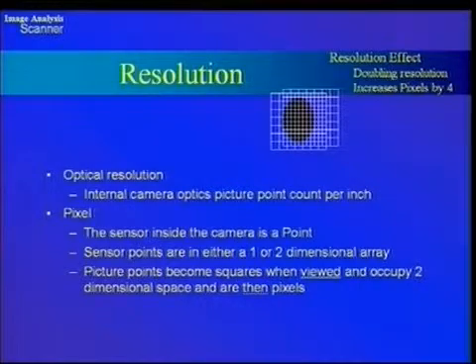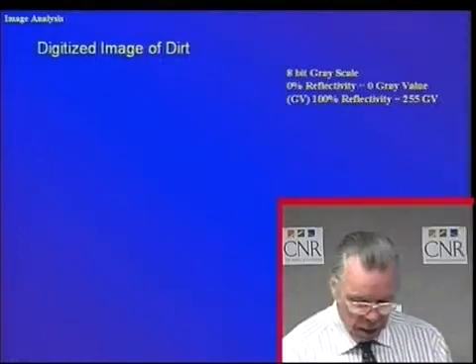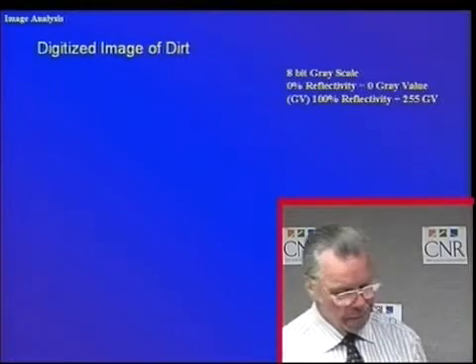For measuring with TAPPI 563, a minimum of 1200 ppi is required. It really works much better at 2400 ppi. But remember, when you go up in resolution, the image increases in size dramatically.